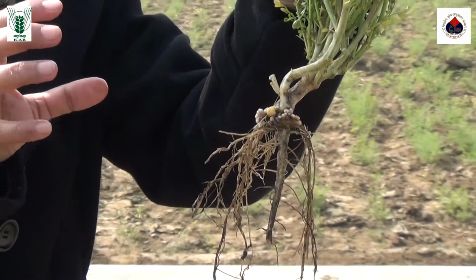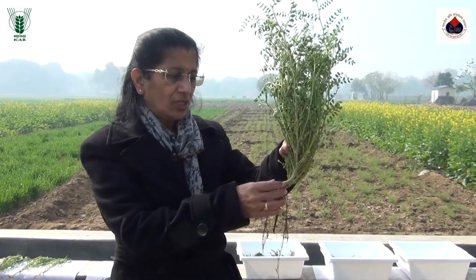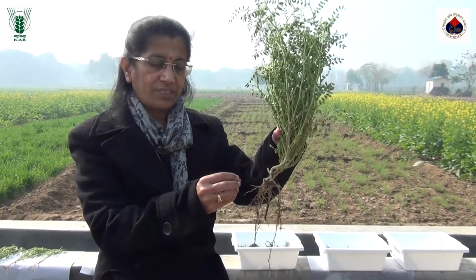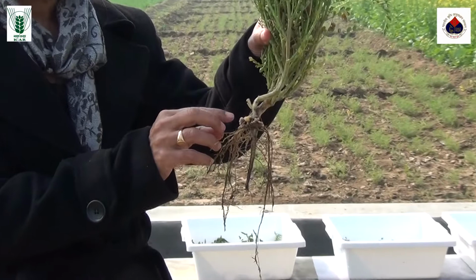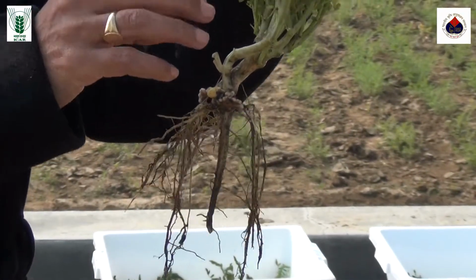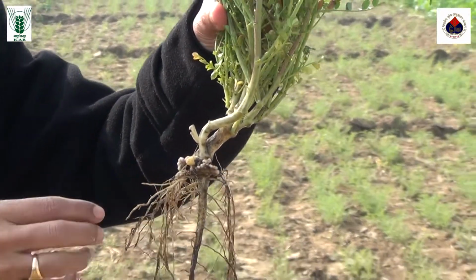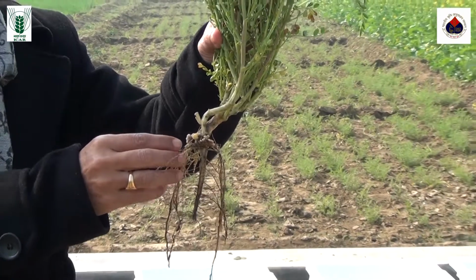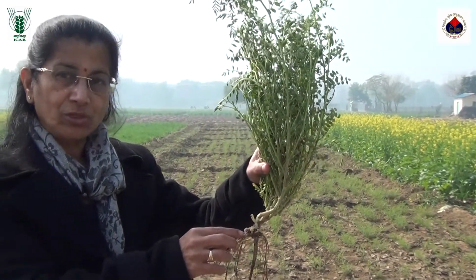In an uninoculated plant, nodules will also be formed, but through the native rhizobia present there. If there is good and effective nodulation, that means the nitrogen fixation which the Mesorhizobium does inside the nodule will contribute to the nitrogen nutrition of the plant. This is what we would like to show you, and later on I will show how to isolate the rhizobial partner from the nodules.